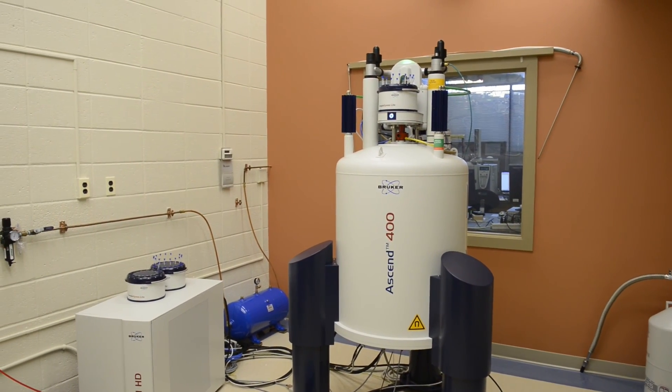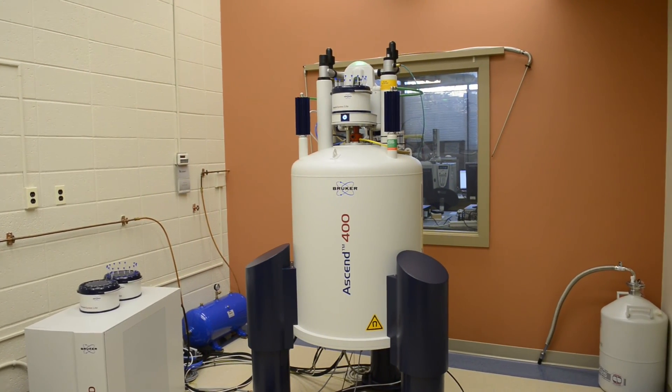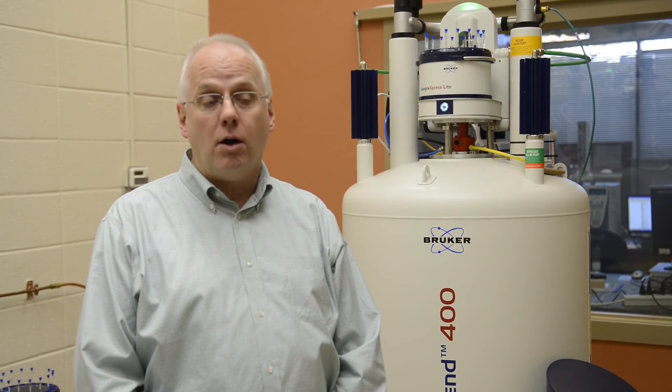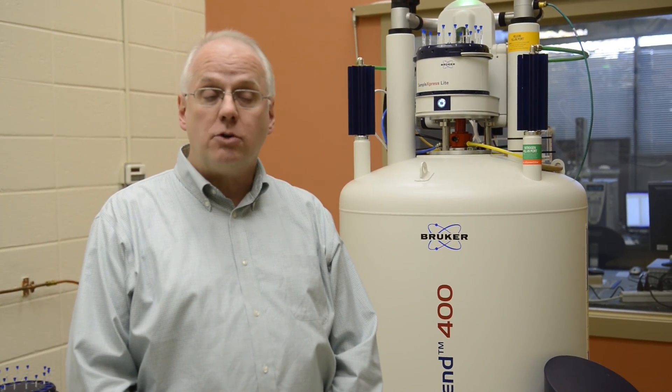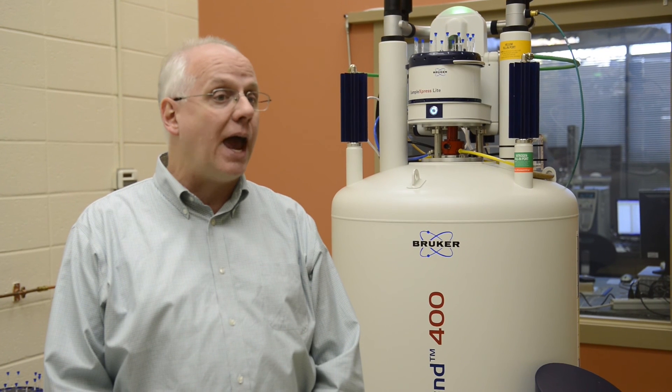This instrument helps students see if they were successful in converting salicylic acid to aspirin. That's something we do in Gen Chem, and all of our Gen Chem majors come through and utilize this instrument, as well as about three or four others, in the analysis of the aspirin that they make in general chemistry laboratory.